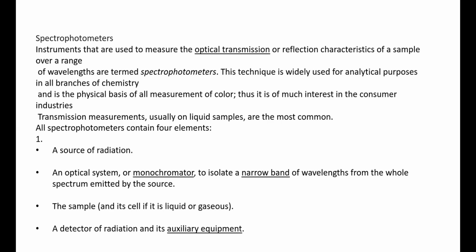Just for the time being, I'll tell you the components of monochromator design, and we will see that in the next part of the discussion. So monochromators are nothing but mainly the prisms, right? Plus diffraction gratings. These are the two words which are going to be useful when you talk about monochromators. So a monochromator includes prisms and diffraction gratings, so that you can select a particular wavelength, and that can be used to characterize your sample.